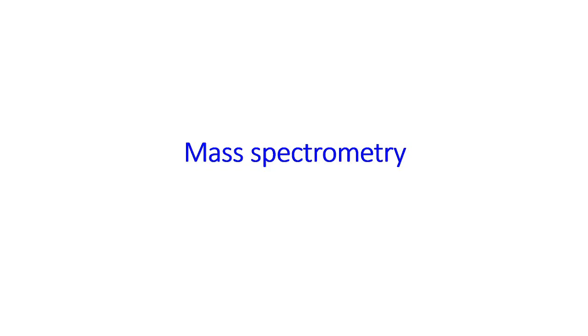Good evening everyone. Today we will start with mass spectrometry. As the name suggests, over here we will be looking into the change in the masses, and basically we will be estimating the molecular mass of the molecules. Okay.